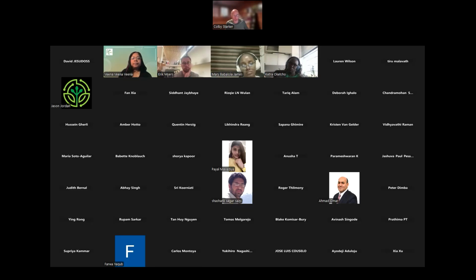That's a tough one, actually. I don't know terribly much about the databases that are available. I definitely know that, for example, Arabidopsis has pretty good data, but generally, most plants don't have good data for where the methylated regions of the genome are, which makes this a challenging aspect of designing guides. At some level, it's just kind of a test and see. The test can be done multiple ways, whether by something like leaf infiltration or protoplasts.